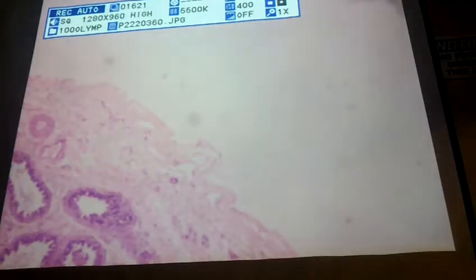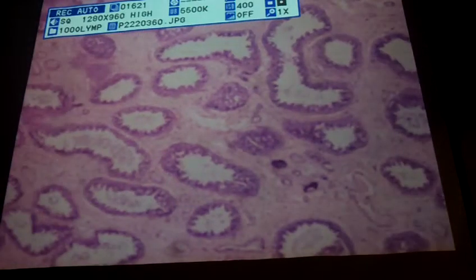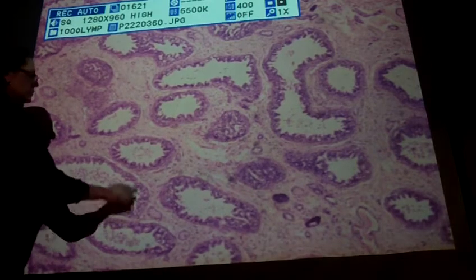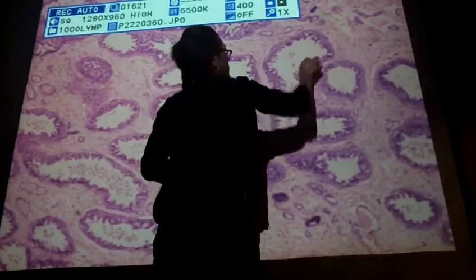Okay. Then let's go to the epididymis. These are the guys that you'll see microvilli. Really long microvilli, and they're actually called stereocilia. So this is at 4x, and this is a cross-section of the epididymis. So you see tubule, tubule, tubule, tubule, tubule, tubule.